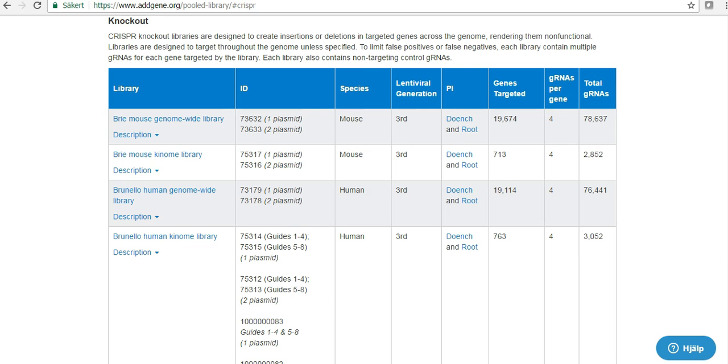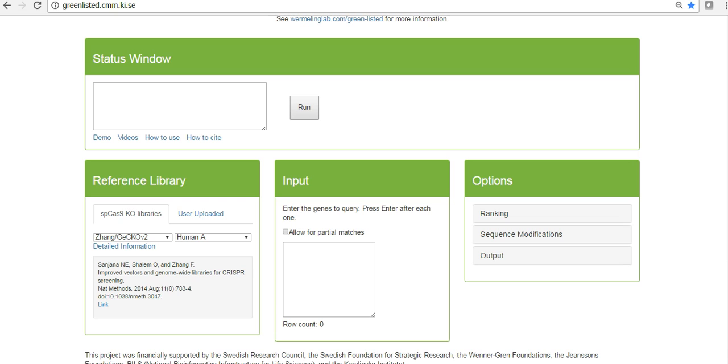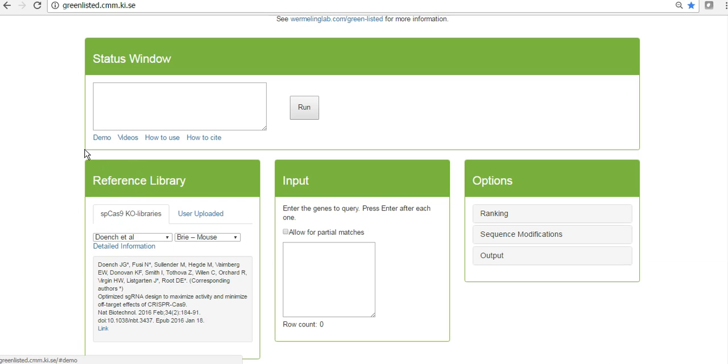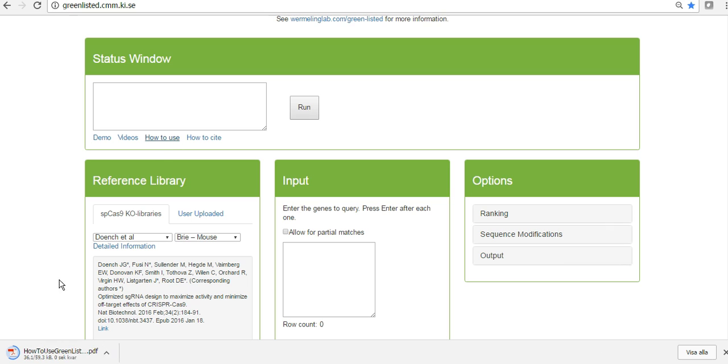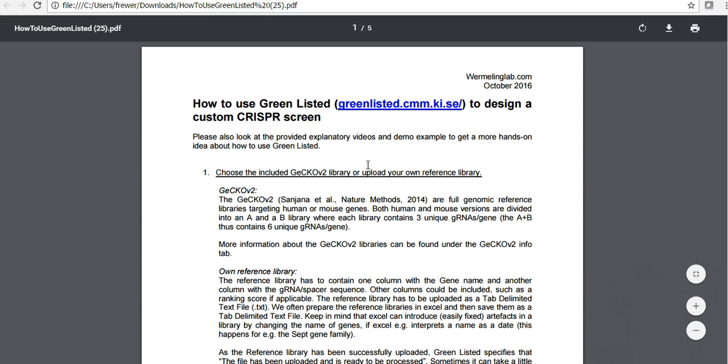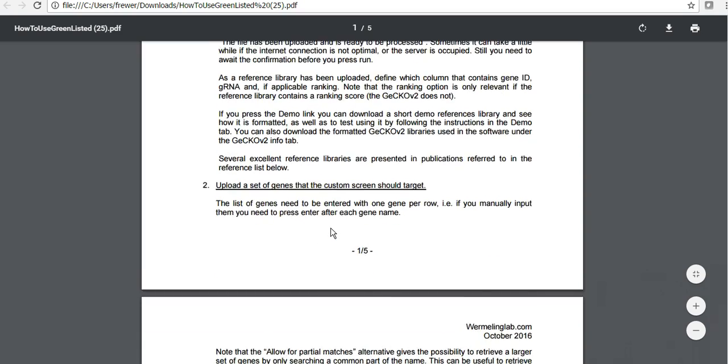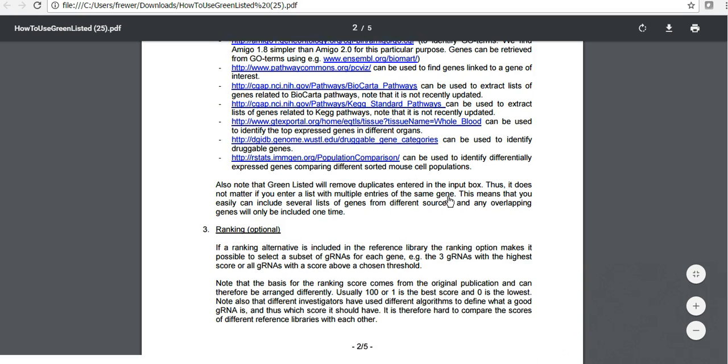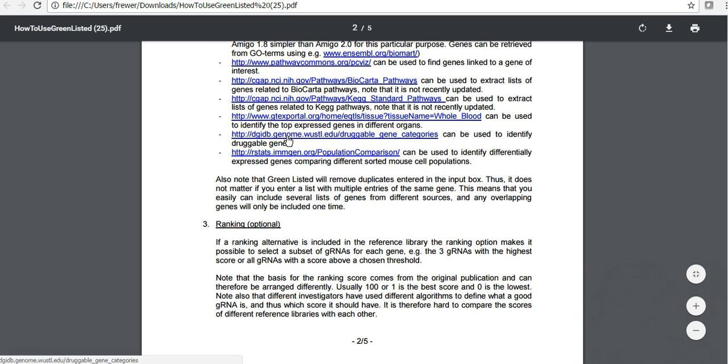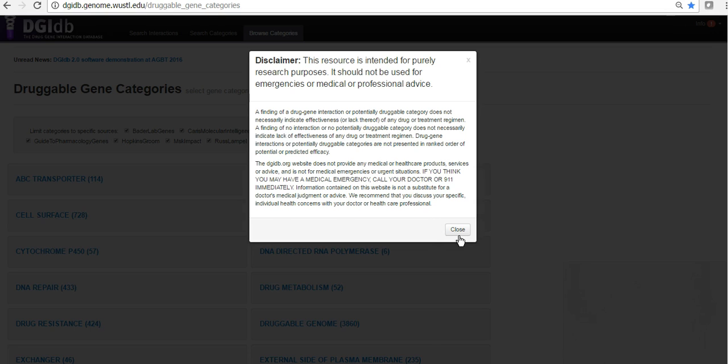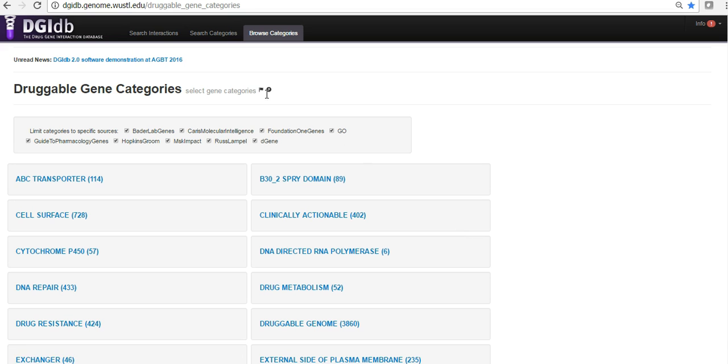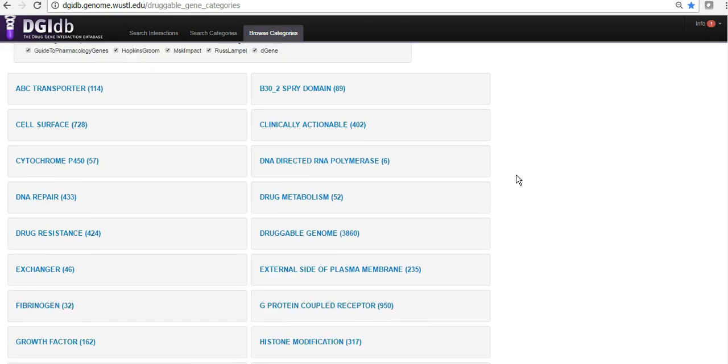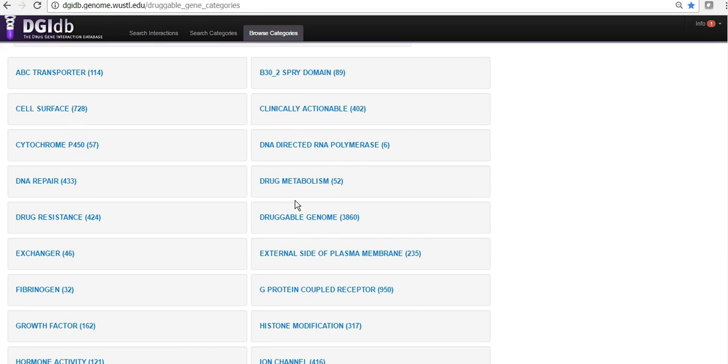And so now I'll show you an example of that then. So I'm going to go here and go to how to use here, which is a file I suggest that you read if you want to use this software. Or if you're using it, it could be helpful. Here are some example web pages we have used to identify interesting sets of genes in the past. I want to particularly go to this web page, the drug gene interaction database, which is a very fascinating database containing a lot of genes that could be interesting as drugs and drug targets.